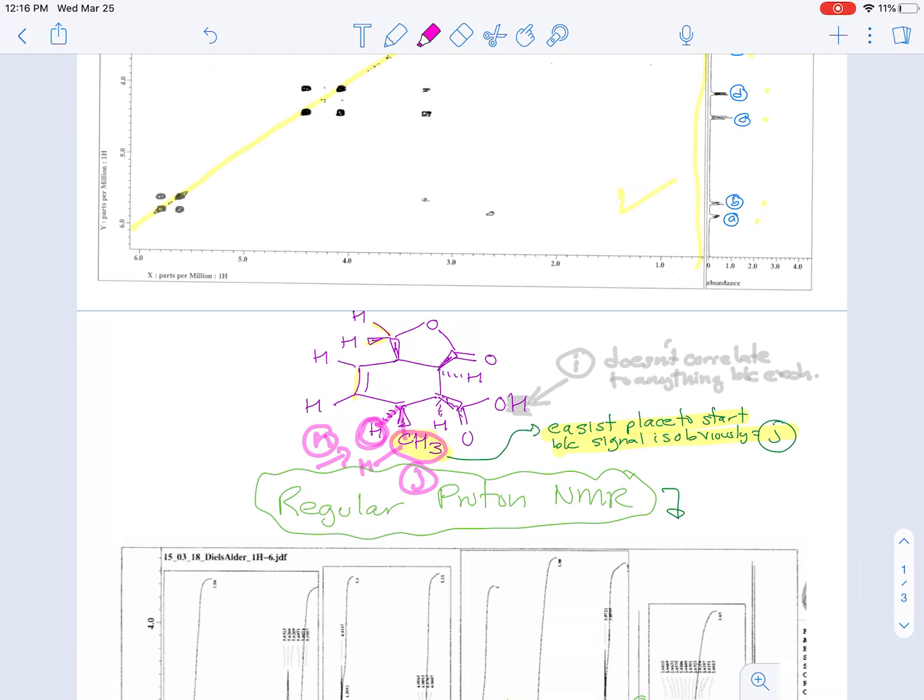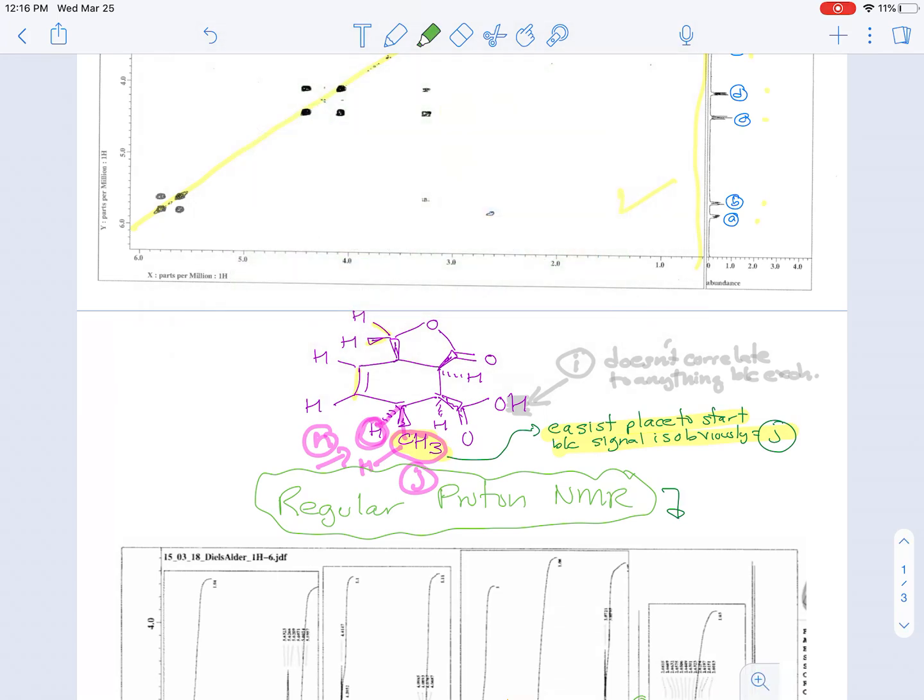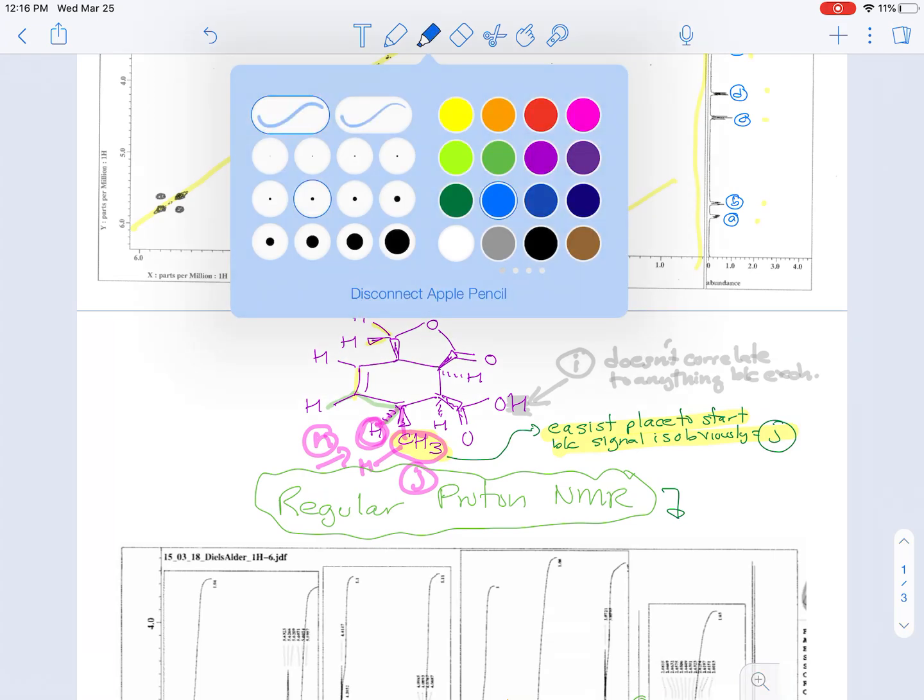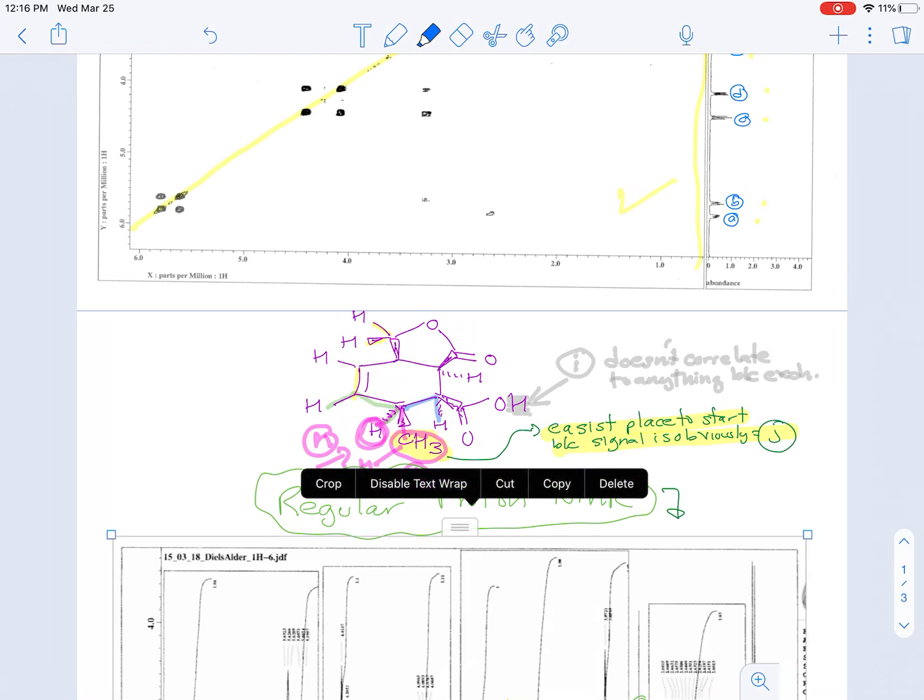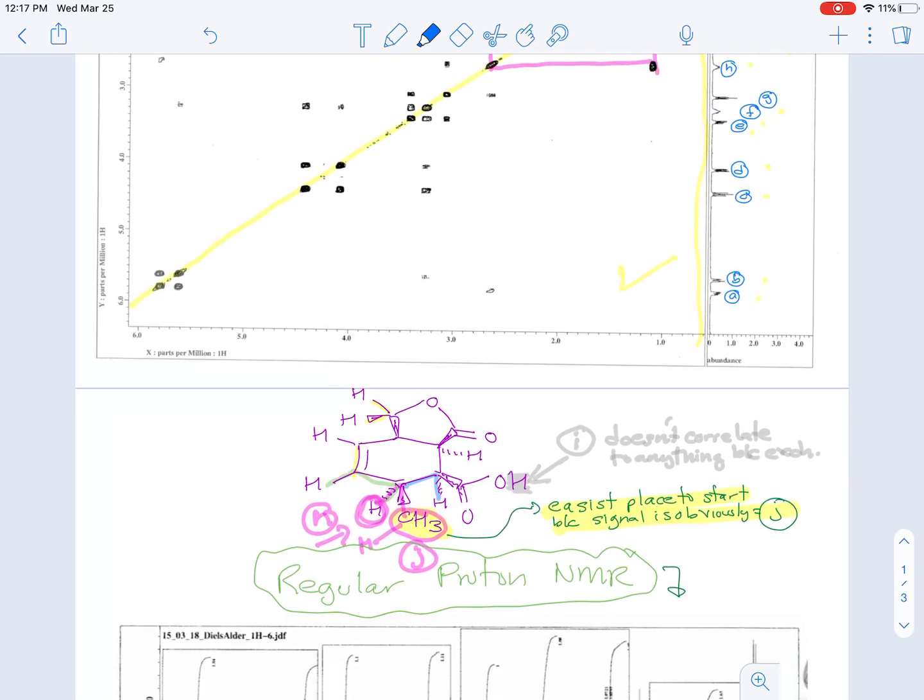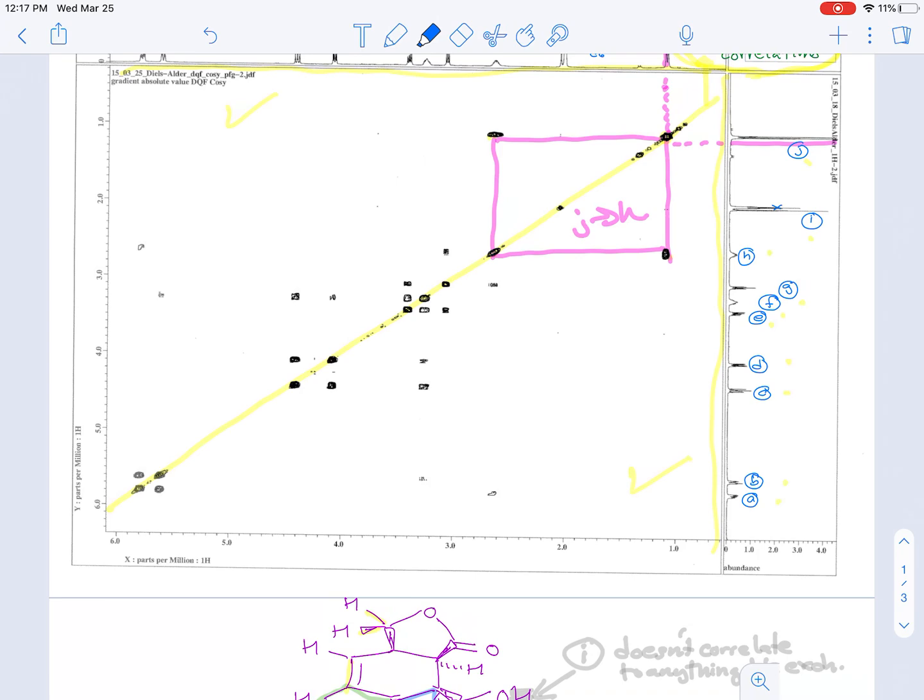Now things get a little bit more interesting because H actually correlates or has a three bond correlation to two different signals. It has a correlation to one of the vinyl hydrogens, and it also has a correlation to this hydrogen that's alpha to the carbonyl group. Fortunately, those two signals - the vinylic one in green and the alpha hydrogen in blue - are going to be different enough that we're going to know which is which.